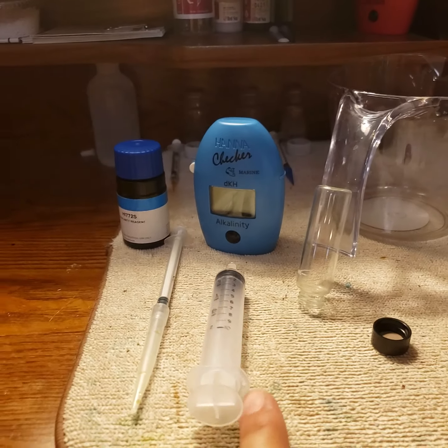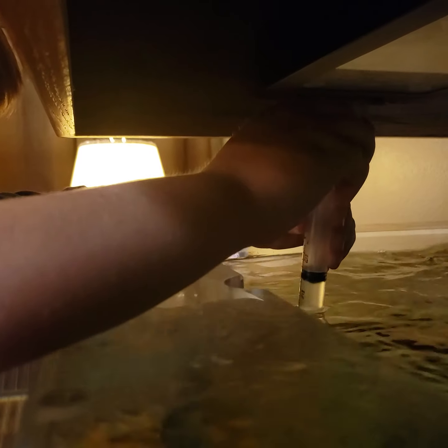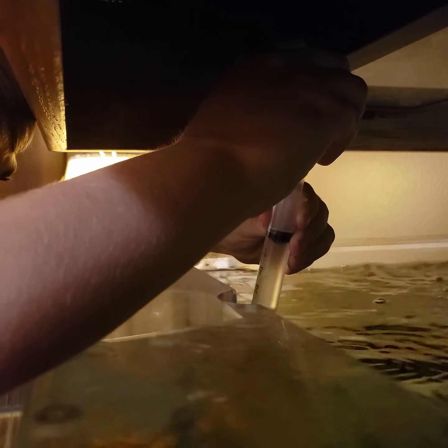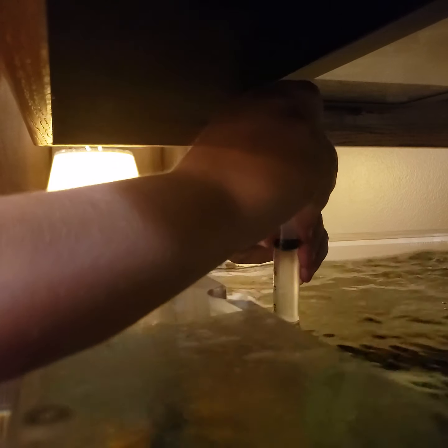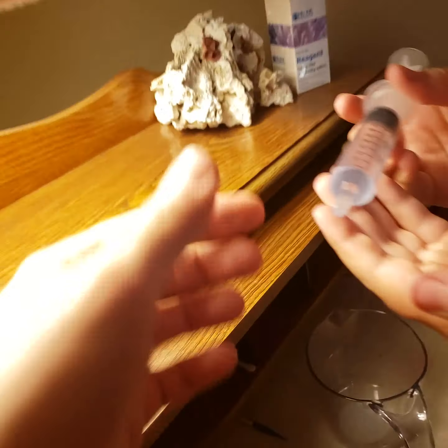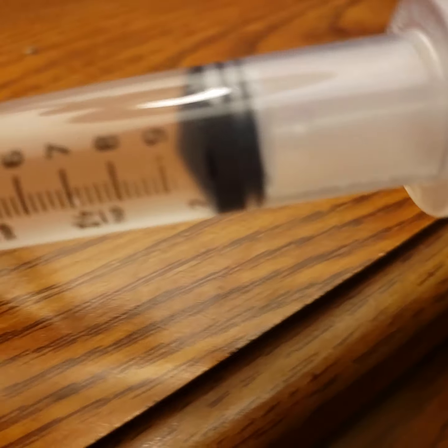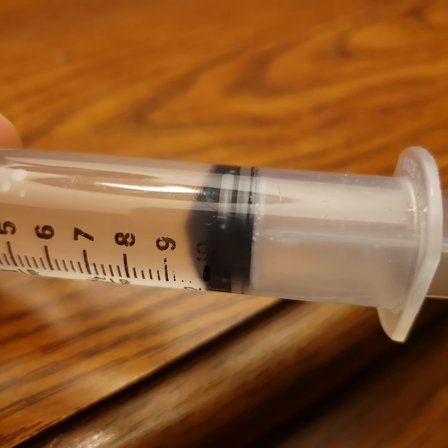He's gonna start by taking this syringe and filling it up to the 10 mark so that the bottom of the syringe is lined up with the 10. And we'll show you that under the light. Sometimes it helps to go up past the 10 and then push it down to the 10. So you see how the bottom of the syringe lines up with the 10.